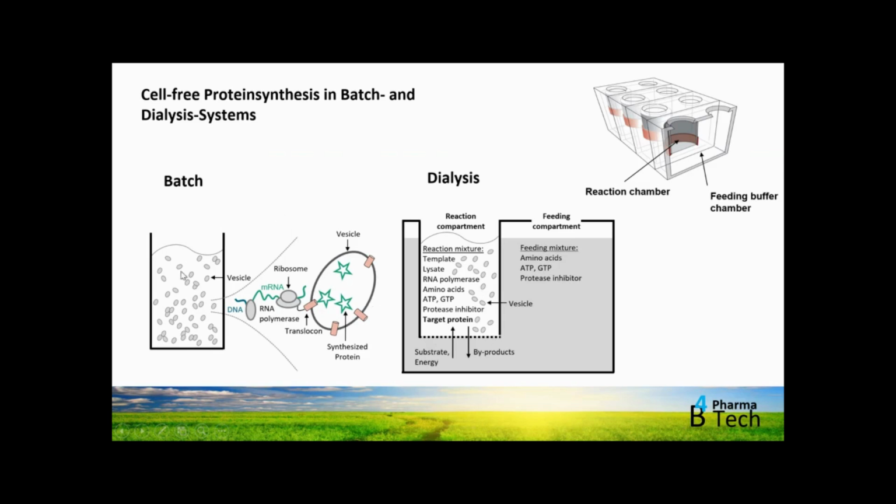As a result, if you produce a protein of interest, once the protein harbors a signal sequence, it will be translocated through an active translocon into the lumen of these ER-derived vesicles. Membrane proteins will be embedded through the translocon into the membrane of these vesicles. This ensures that 100% of the membrane proteins that end up in this vesicular structure have the same orientation. So it's not a statistical incorporation of a membrane protein in a lipid bilayer, but rather an oriented, directed introduction of the protein by the translocon into the membrane of the vesicle.